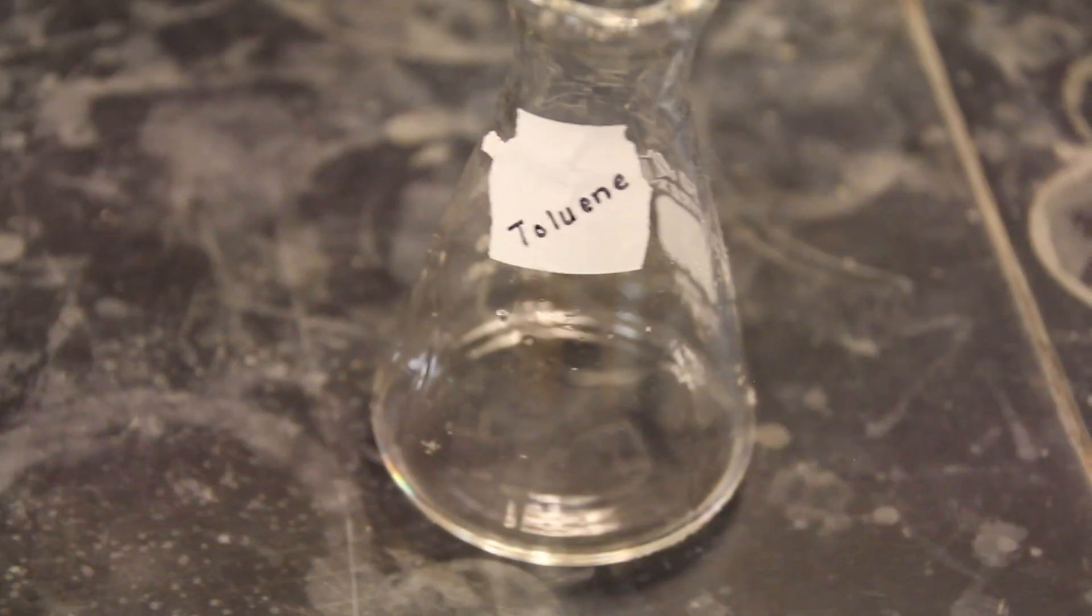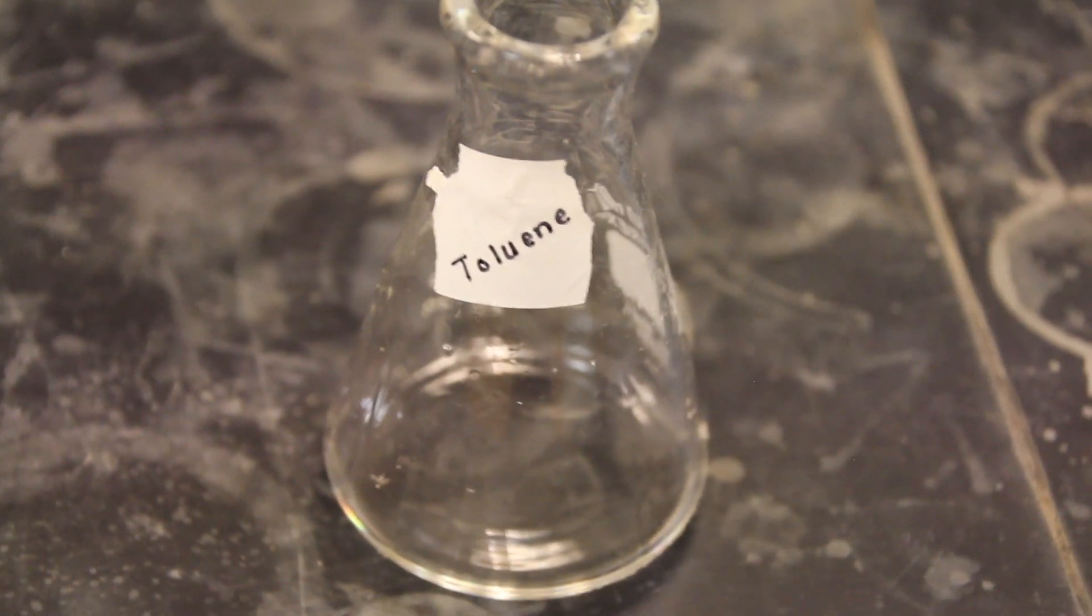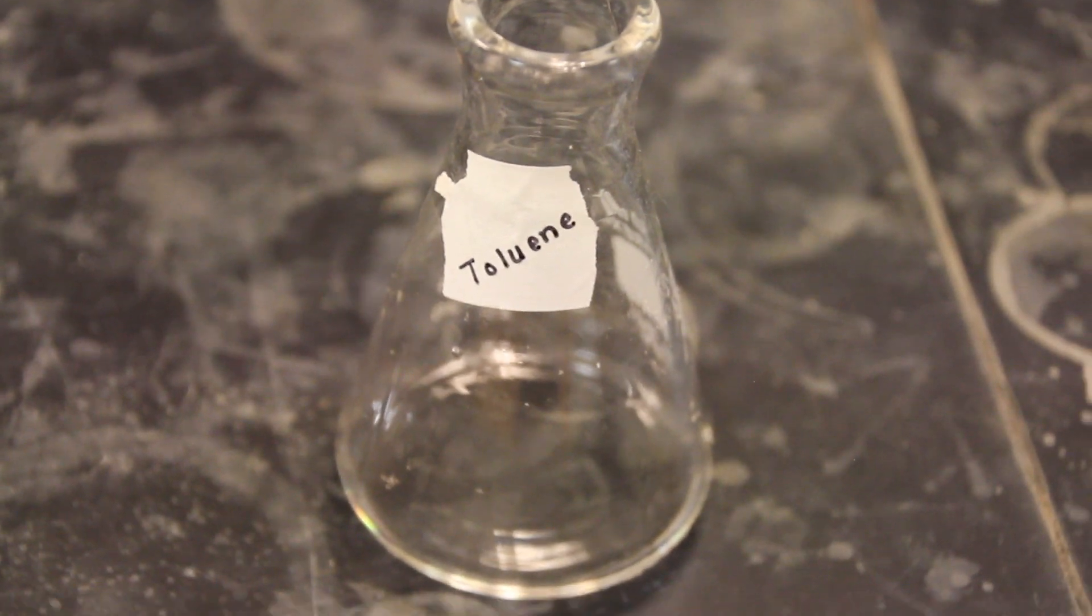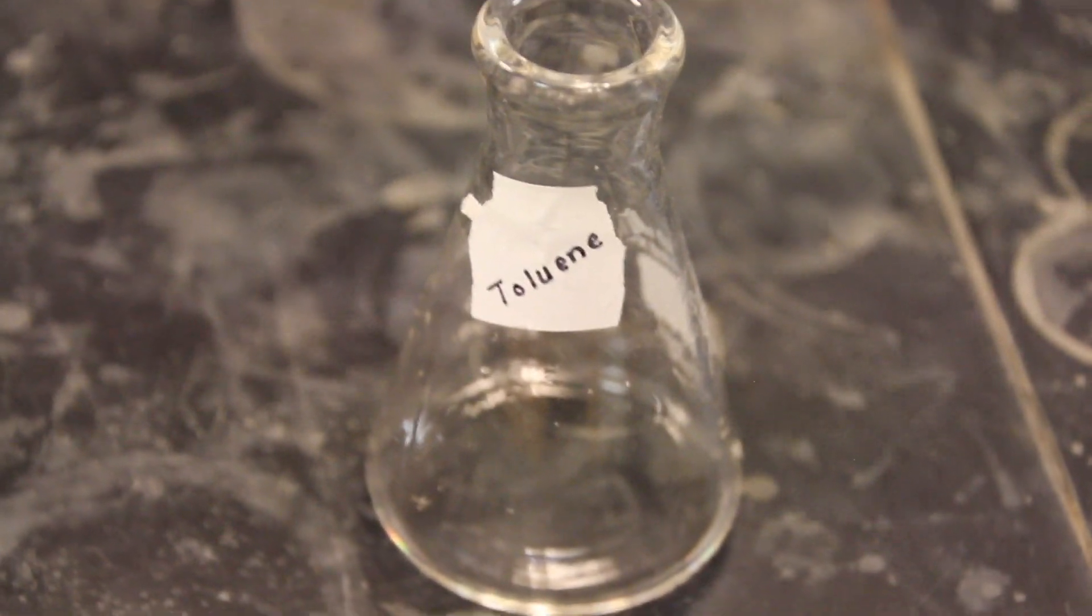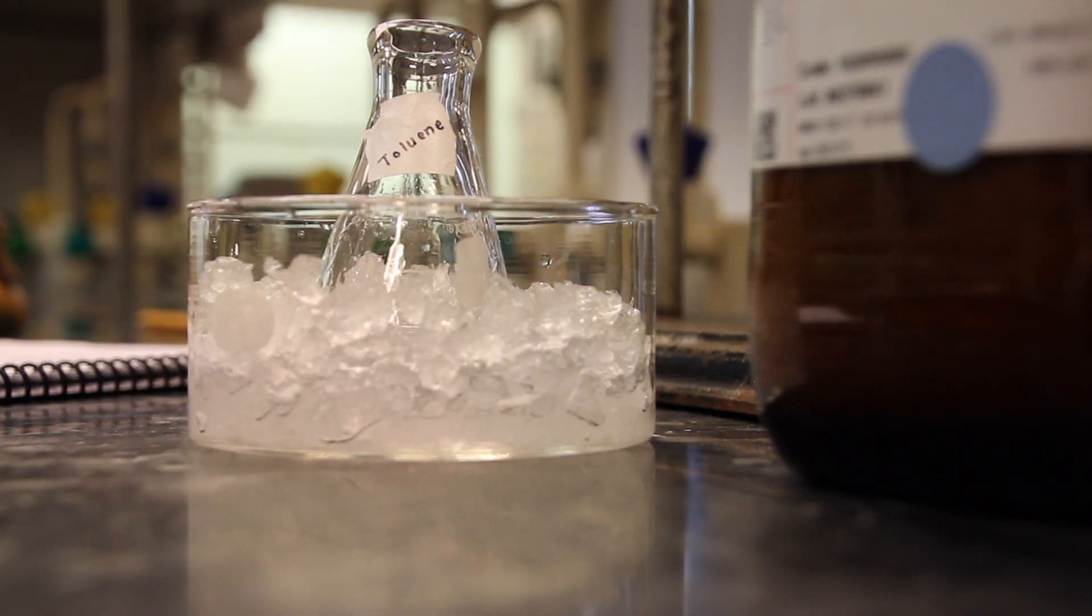If the compound does not dissolve in the solvent at room temperature, but does dissolve upon heating, the final step is to see if the compound will recrystallize or stay in solution upon cooling.